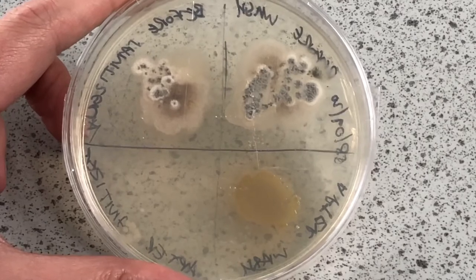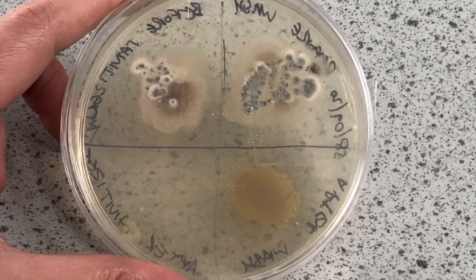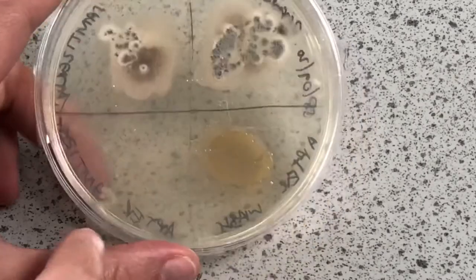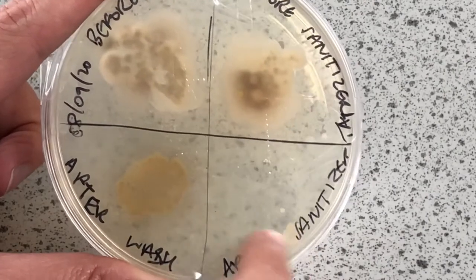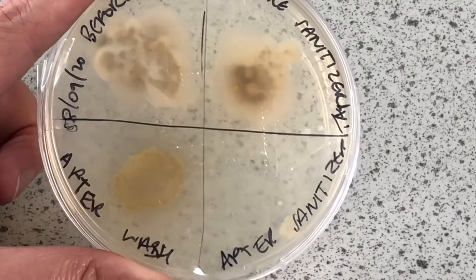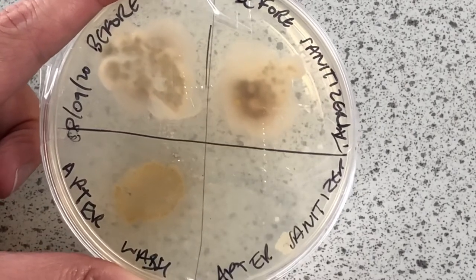We've got a lot of growth of bacteria after washing hands, which I think can only be down to using paper towels that have been made in a factory where maybe the standards aren't the same as they would be in a food or drink producing factory. But hand sanitizer is definitely doing the job. Here's the hand sanitizer — no growth, just a tiny bit at the bottom which could be contamination from somewhere else. After washing definitely didn't look as good as the sanitizer. Hope you found that useful, thank you.